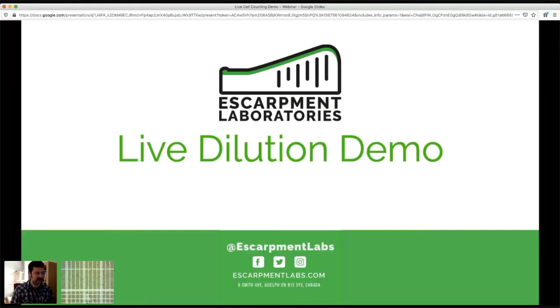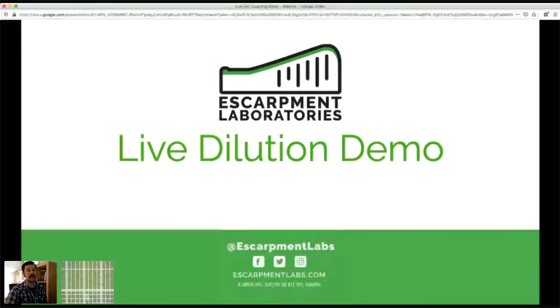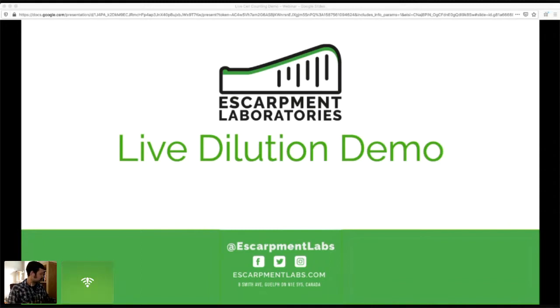So, a live dilution demo. I've done my dilutions already. I'm going to show proper dilution technique. First off, I need to switch my camera again. So this will be fun. I have a DSLR running to show some bench work. Should be this one. All right. Okay, so let's focus on this camera.